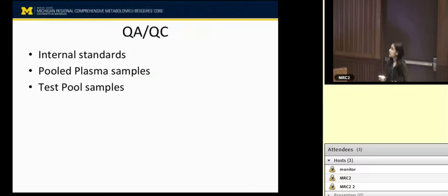Now let's diverge a little bit and talk about databases. This question also came up today, and I'll explain the reason why we are talking about this. LIPID MAPS is the first internationally recognized classification system for lipids that we have. This is a great resource for all the lipid information you can get, and it has more than 40,000 unique lipid structures in its structure database. You have some good tutorials about lipids, not exactly pathways, but information related to pathways and pathway creation tools. Then you have some MS-based search tools, and also MS/MS spectra for 500 standards that you can get from here.